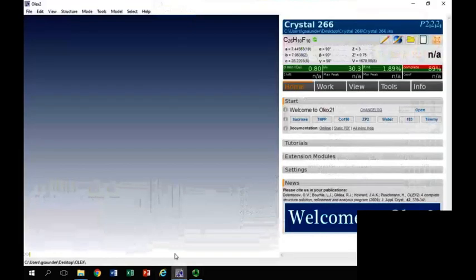Okay, so there we are. You can see that we've got an Rn value of 1.89% there. We've got a number of molecules in the unit cell of 3. Number of molecules in the asymmetric unit, Z dashed, is 3/4, so something's not quite right. The complete value there refers not to how complete the structure is, but how complete the data is. How much data have we collected? And that will change with space group and symmetry and so on.